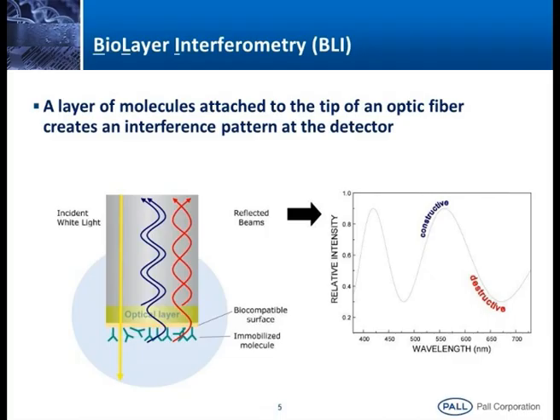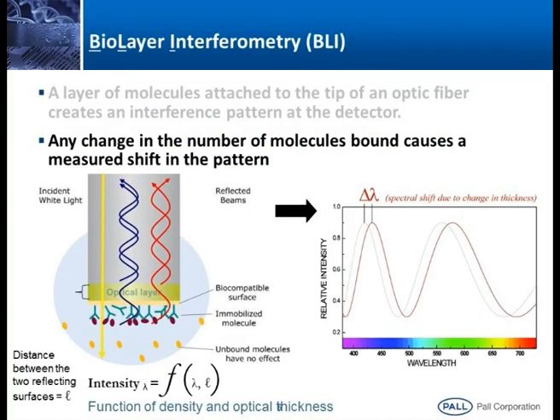It is not that all the light is reflected; only 5% of the light gets reflected, and the rest, 95%, is transmitted into the well. The light going through the ligand meets an obstacle due to your ligand, and once again light gets reflected back. Constructive interference makes the signal rise; destructive interference makes the signal drop. Now, when I dip the same sensor into the corresponding binding partner, I will give an example. Here I am using a sensor coated with protein A. Protein A has a strong interaction with a monoclonal antibody.